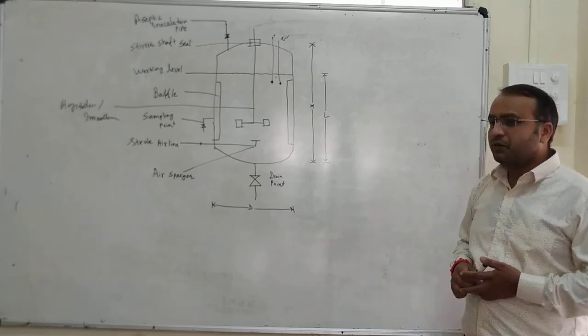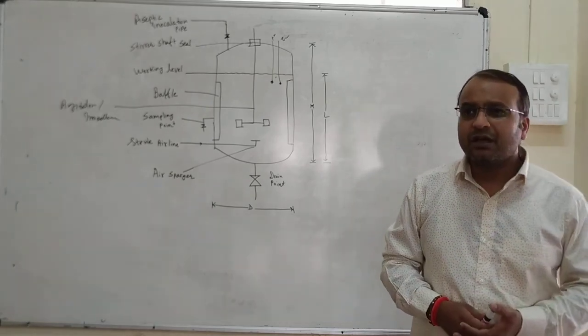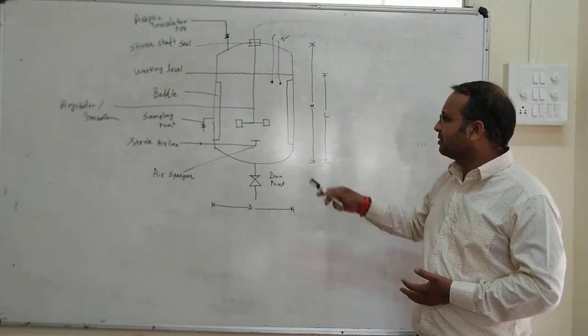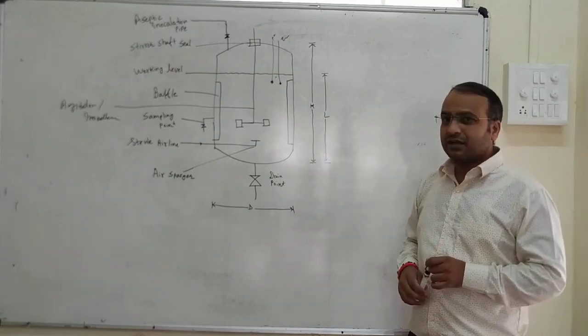For any fermentation overall, the fermentation media should be available throughout the year. If you are considering just the basic design, I guess these points are sufficient.